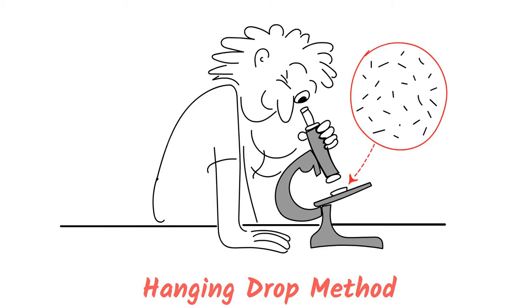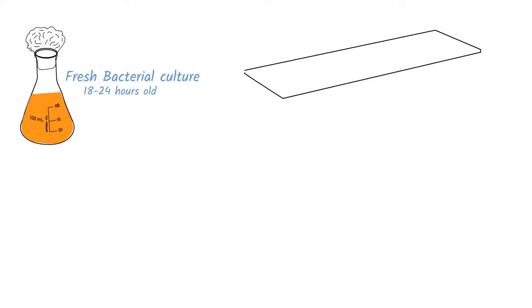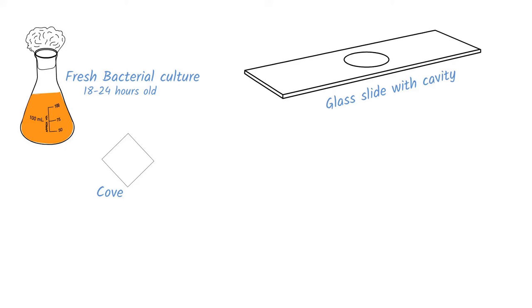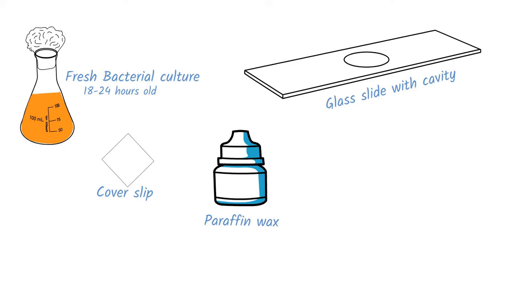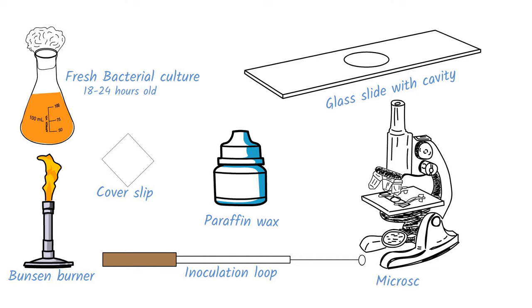This is a very simple technique, and at the same time, requires a lot of care while preparing the slide. To perform this technique, we need a fresh bacterial culture, usually 18 to 24 hours old. A glass slide with cavity. Cover slip. Paraffin wax to seal the cover slip. Inoculation loop. Bunsen burner. And last but never the least, a microscope. Let's see how to prepare the hanging drop using all these materials.